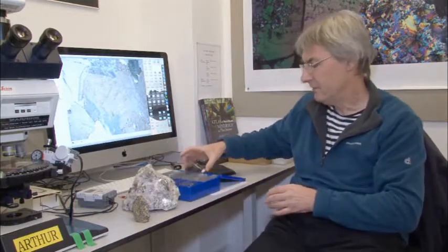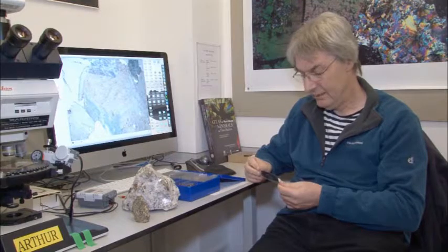Those chips of rock are then mounted onto a glass slide, and the glass slide is then finished by hand with a highly qualified technician who grinds them down to 30 microns.